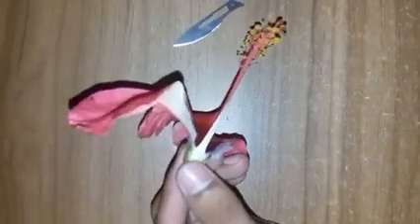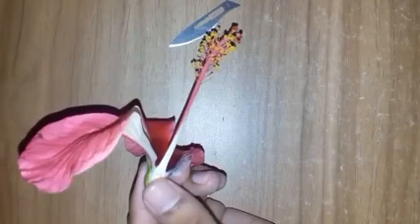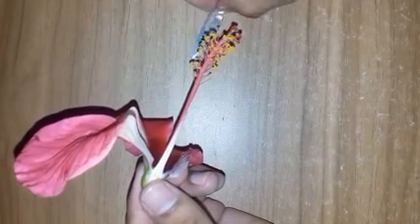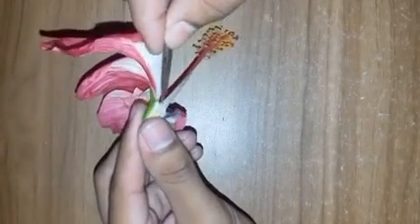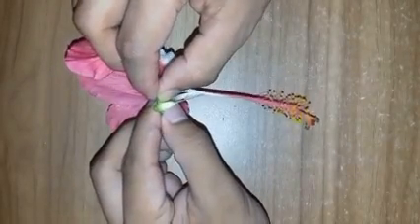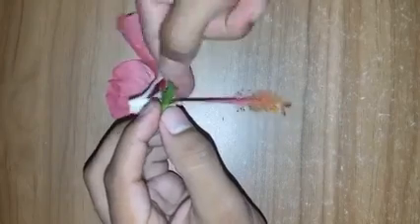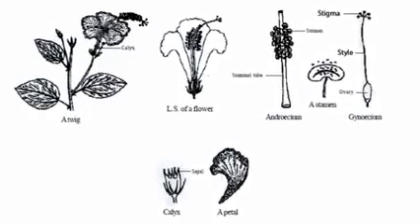The calyx and corolla are the non-essential or accessory whorls. The androecium is the male part of the flower. The gynoecium is the female part of the flower. Both are involved directly in reproduction, so they are called essential whorls or essential reproductive organs. Children, draw and label the parts of the flower, and dissect and display them in order: calyx, corolla, androecium and gynoecium.